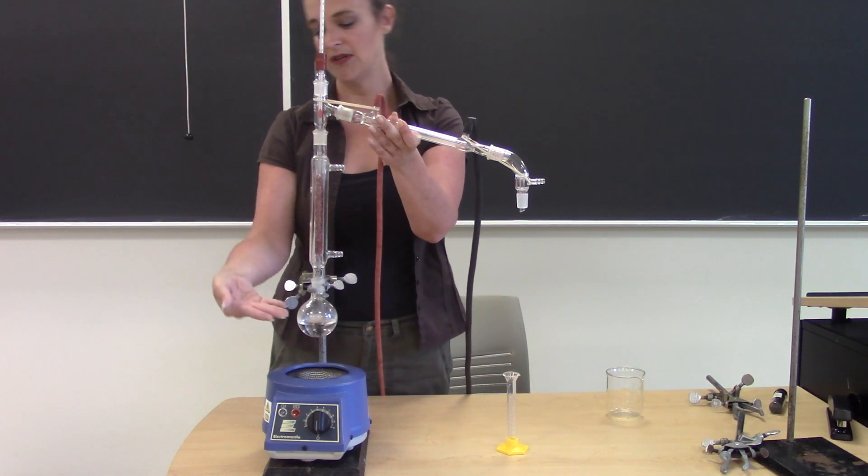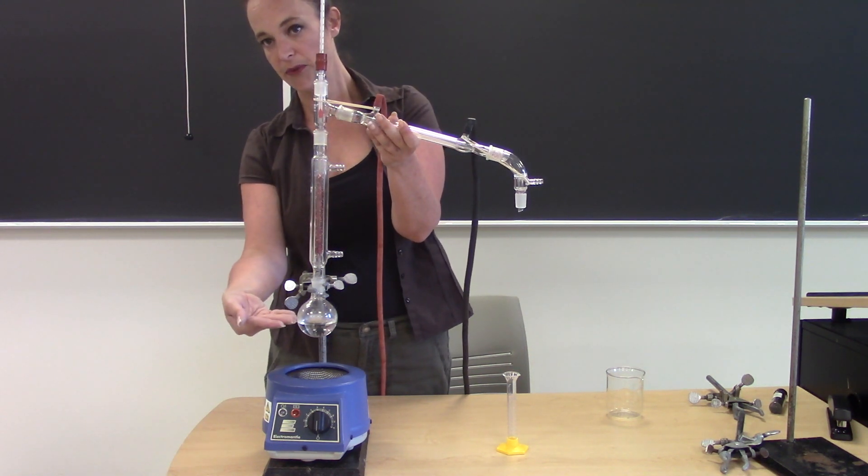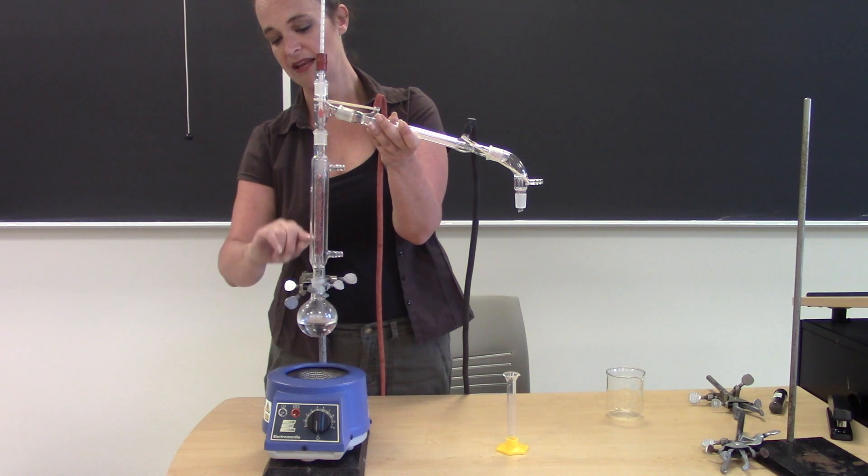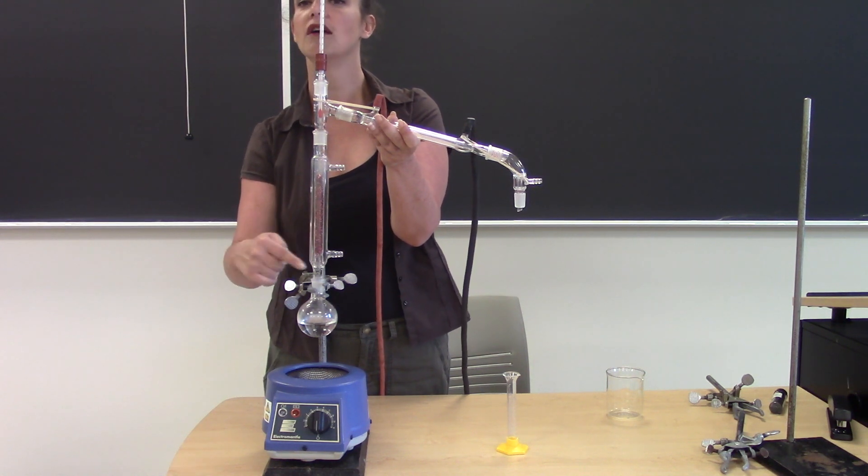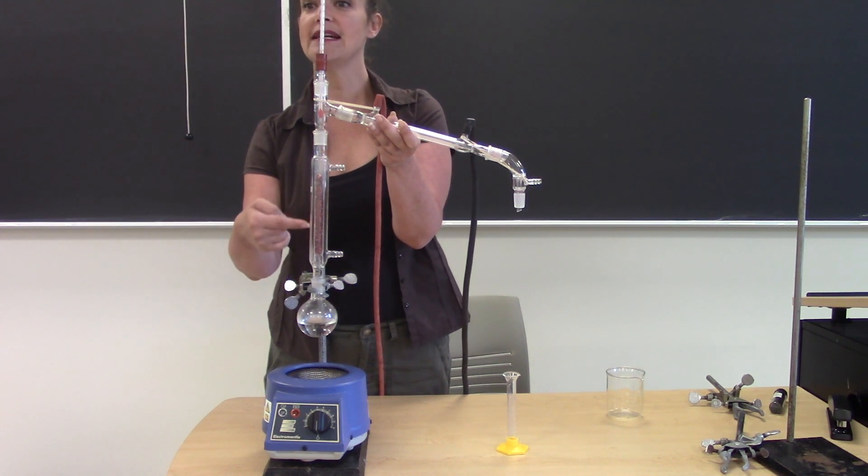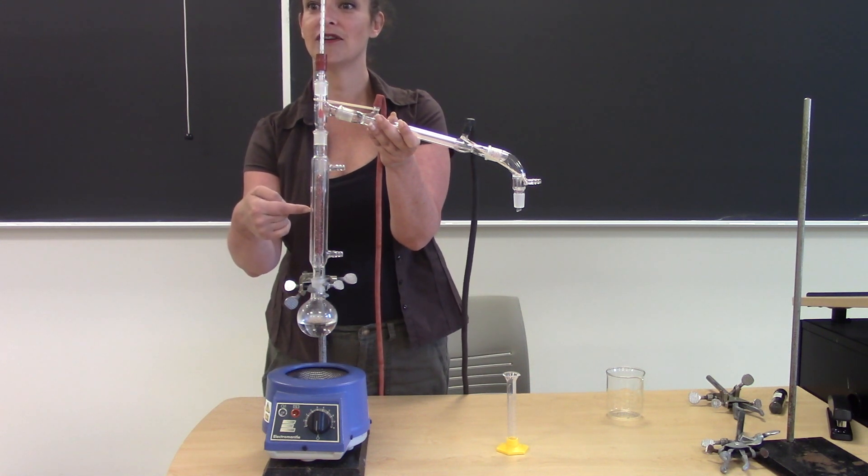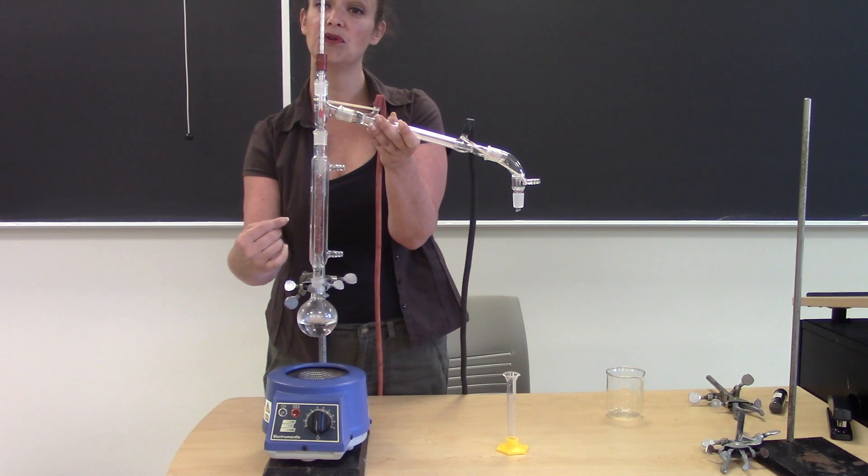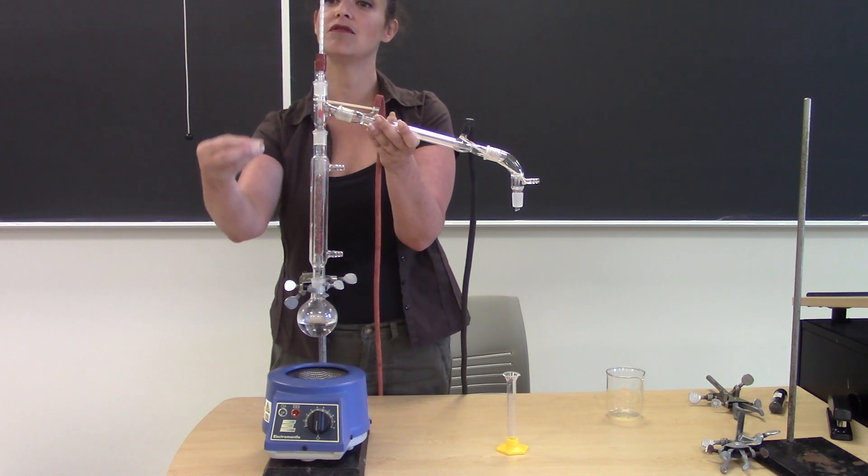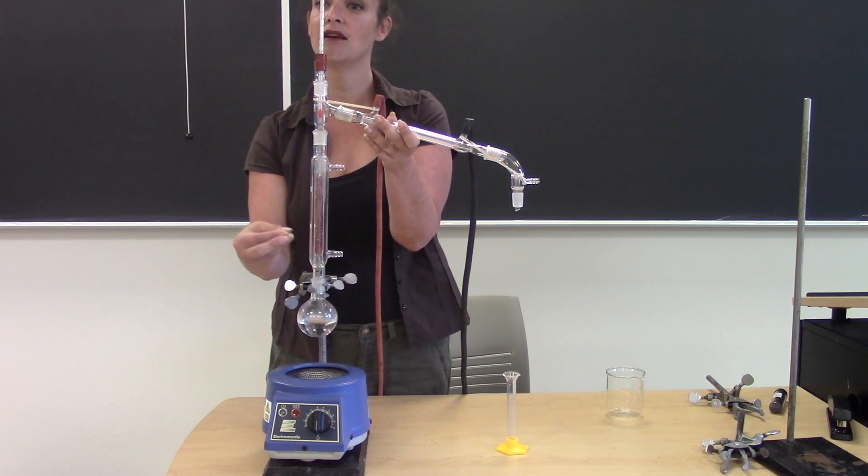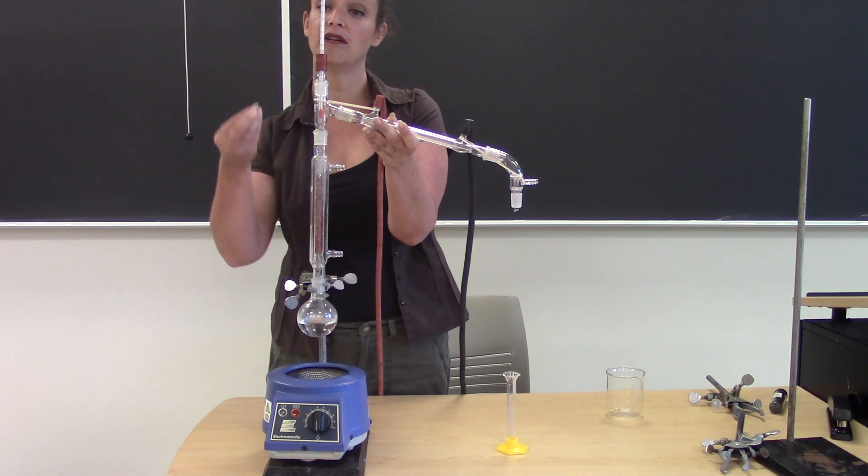Now what's going to happen is the liquid boils, the vapors come up and they hit the copper mesh, they recondense there. But then they're going to vaporize again and they're going to condense farther up and they'll vaporize again farther up. And each time you go through this vaporization condensation process, you purify your liquid a little bit more.